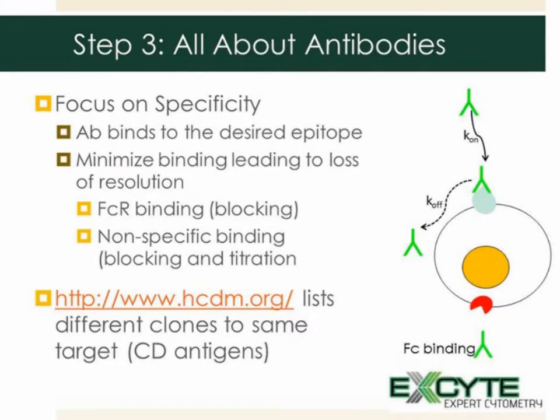The other area that is important is non-specific binding. This is the idea that the antibodies will bind to anything, any protein that is there, if they can't find their primary target. This non-specific binding is increased when we have a lot of antibody present. So in addition to blocking, we need to perform titration experiments to find the optimal concentration of antibody that we wish to use in our assays.